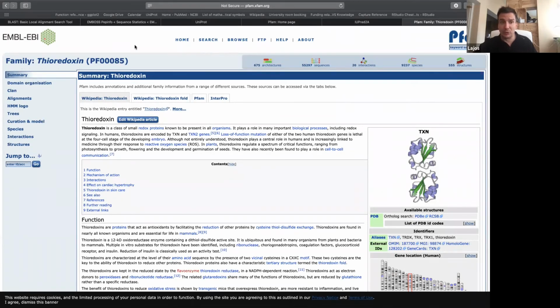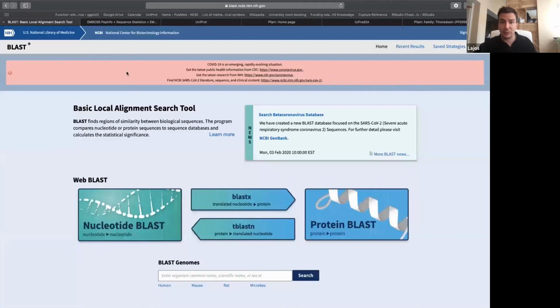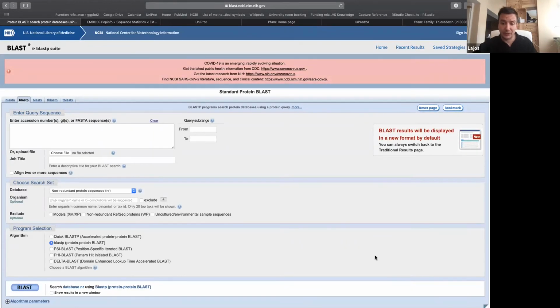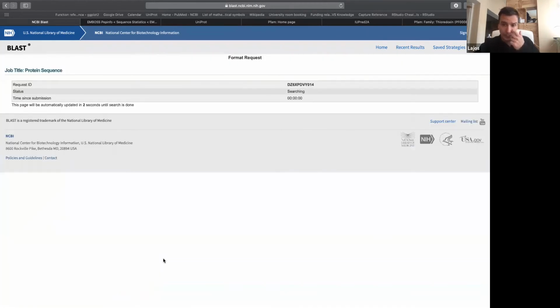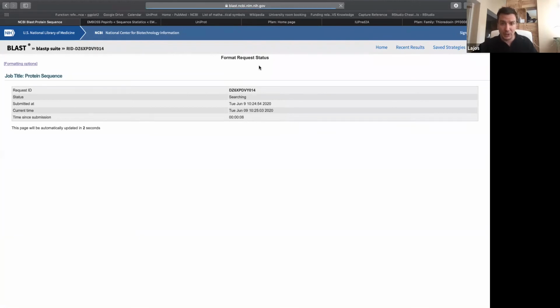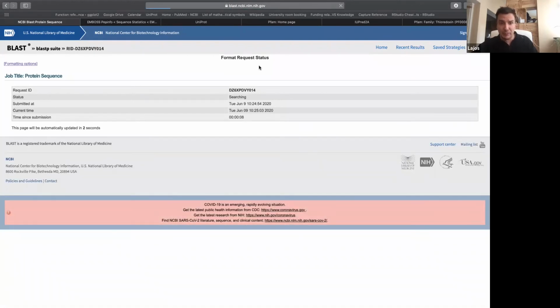You can also, of course, BLAST the protein, and we can do it for this sequence. Just use the default settings of BLAST. This is BLASTP, of course, because we are blasting a protein. And of course, it will give us one of these. It's an already known Staph aureus gene, so it's not a novel gene, but I think it will also give us some not very descriptive results.